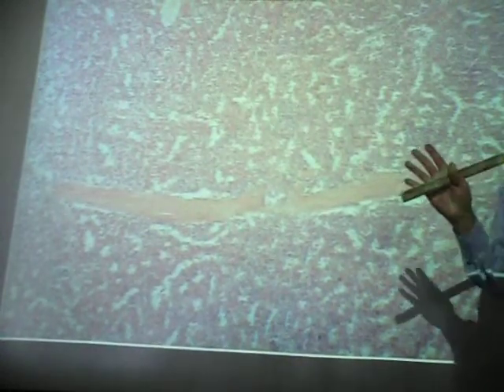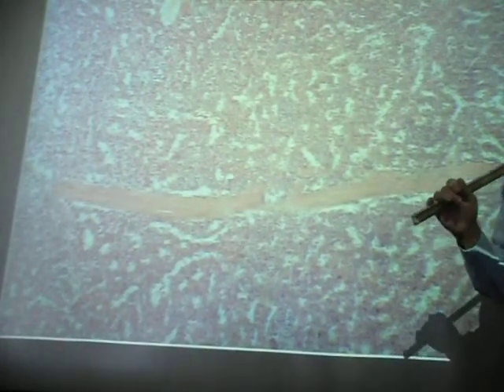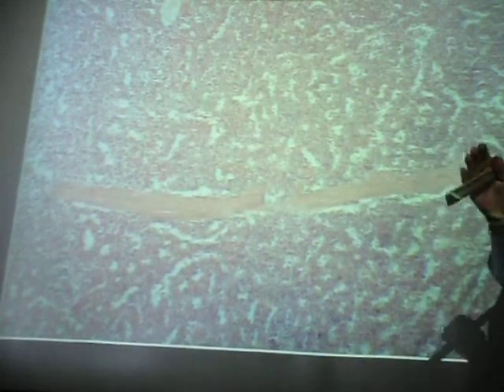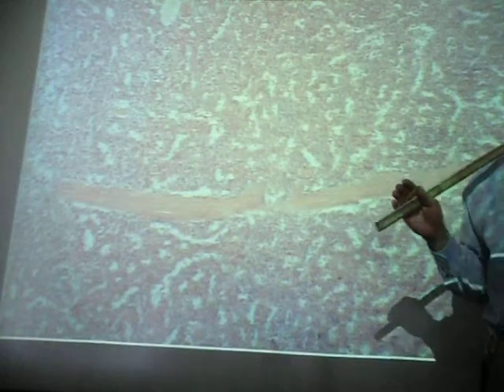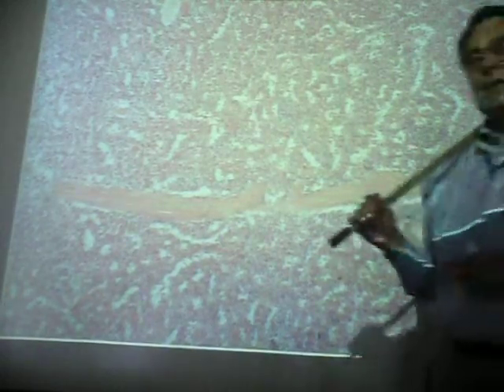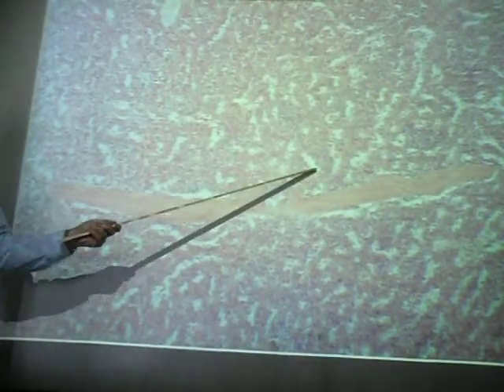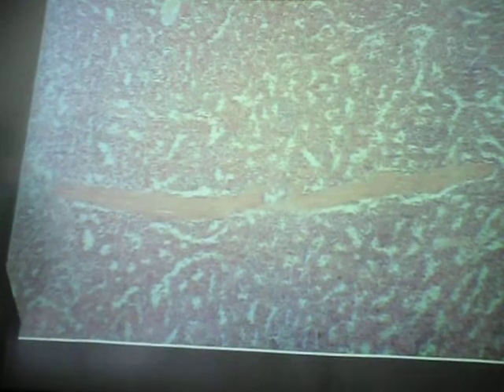Okay, probably the easiest thing to remember is splenic sinus. Do not call them medullary sinuses. There's no medulla here. Otherwise, it's going to be a red line through your answer, okay? Medullary sinuses are in the lymph nodes, not in the spleen. So you may call these splenic sinuses.